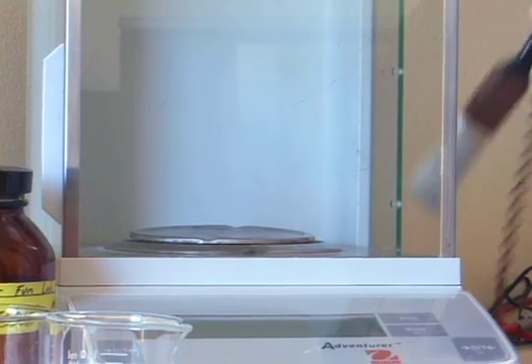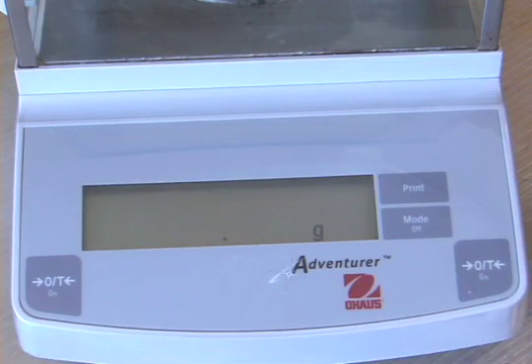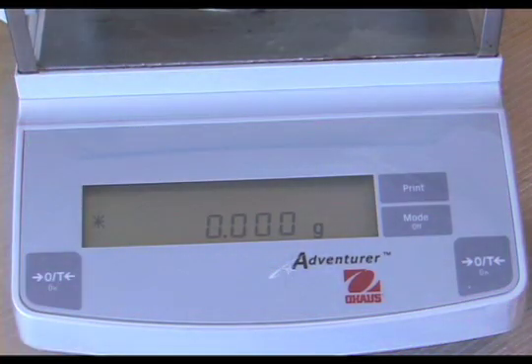To start, make sure that the balance pan is clean. Press the on-tare button to zero the scale. When the star appears in the readout, the scale is ready.